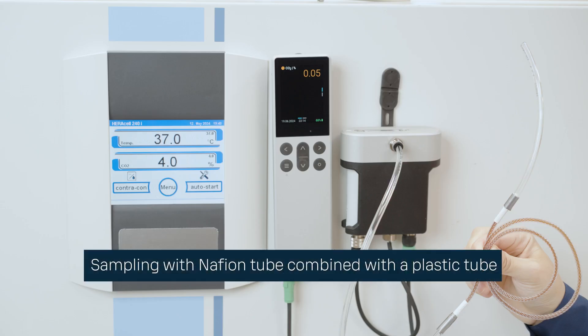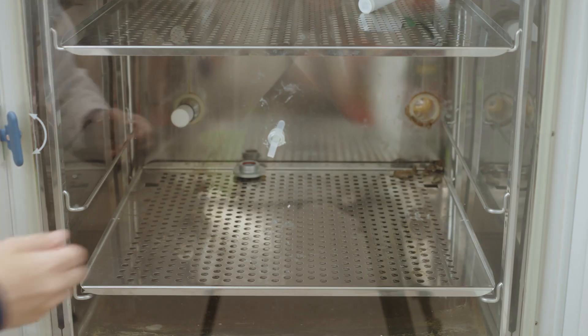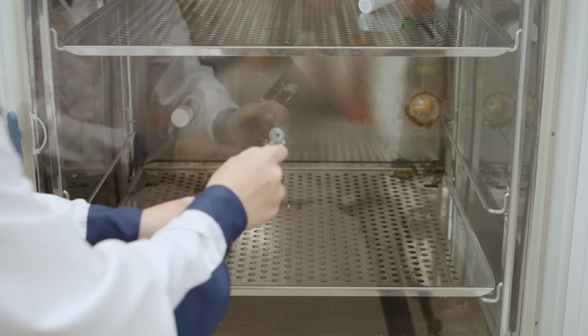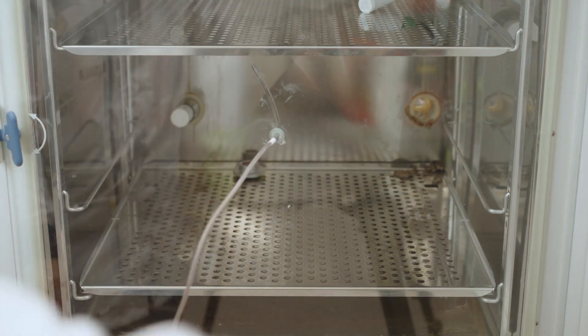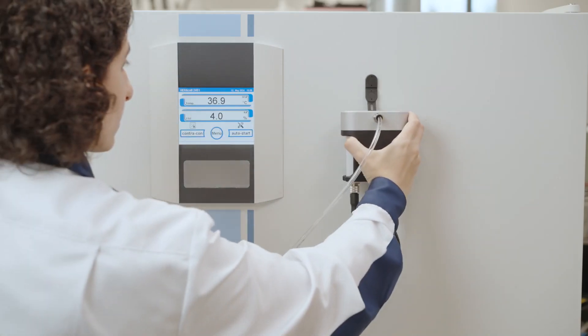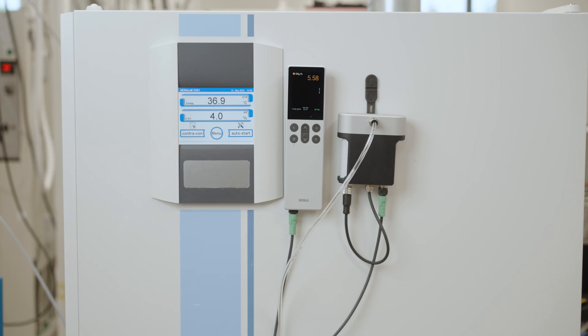I will show how to do sampling with the Nafion tube combined with the plastic tube. Instructions for other sampling methods, please refer to the GMP 80P pump user guide. Now let's insert the end of the Nafion tubing into the incubator. Sampling will start automatically when the GMP 80P pump is connected to the IndiCo 80 handheld. Sampling the hot and humid air from the incubator causes condensation, which will increase CO2 concentration on the GMP 80P. The sample can be dried with the optional Nafion tubing.